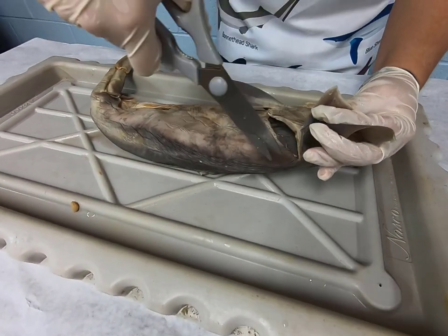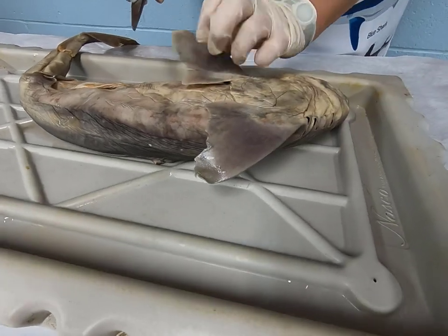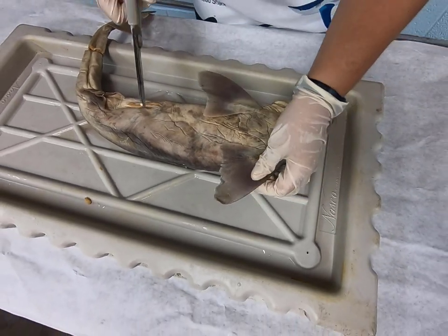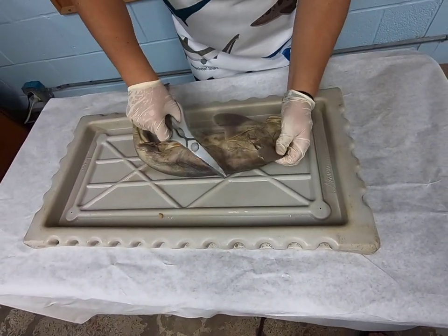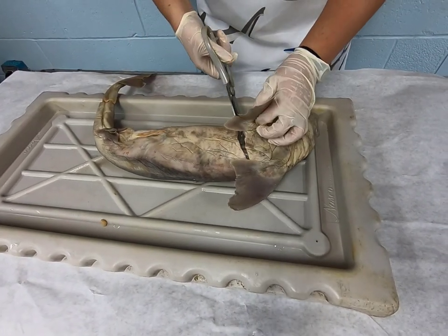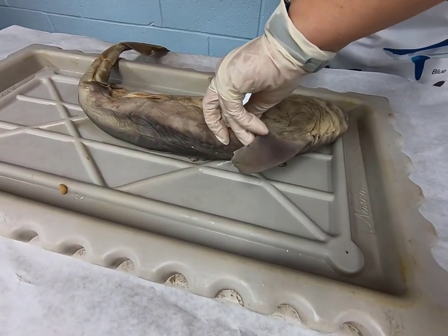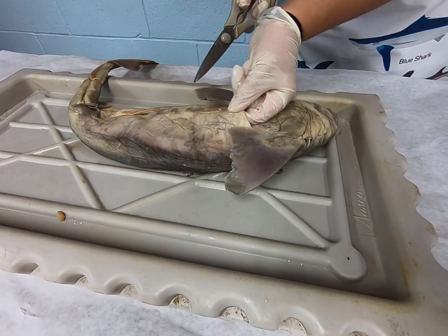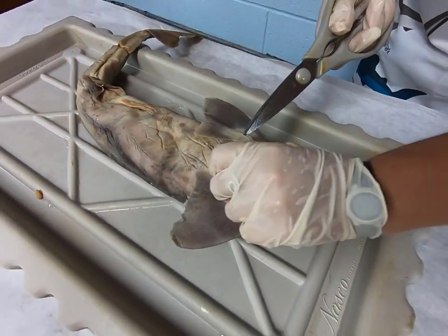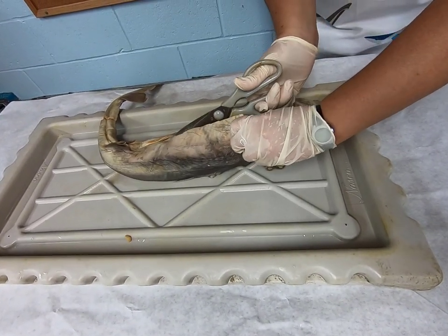And does anyone think in your brains a little bit why we call these fins instead of flippers? So think to like a sea lion. Sea lions have those big flippers on their pectoral flippers. We call them flippers. And sea turtles, we call them flippers because they move. Fins stay put. All right. So the skin is pretty thick, and I can just pull up that skin, put my finger under there, and cut all the way down to the anus.